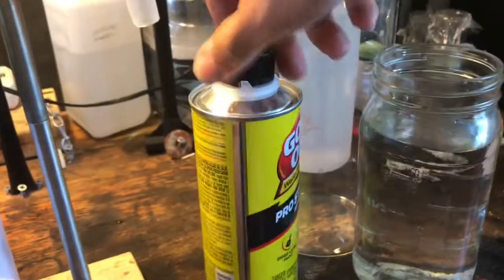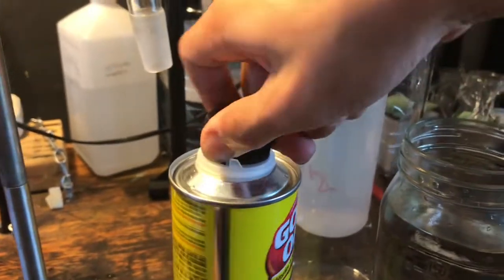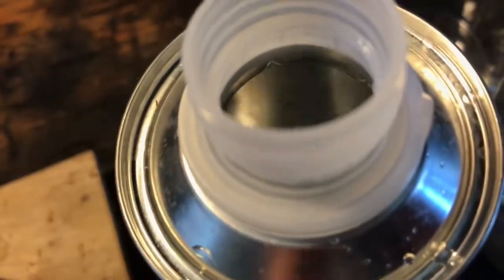This Goof-Off contains xylene and acetone, as you can see. The first step in extracting is trying to get the cap off. You can see the liquid is a clear liquid, so it's pure, I guess.